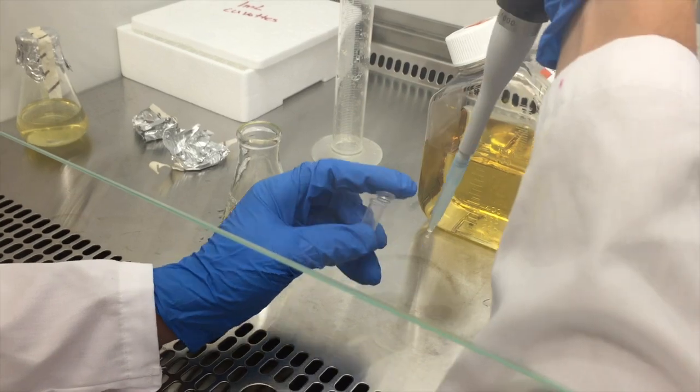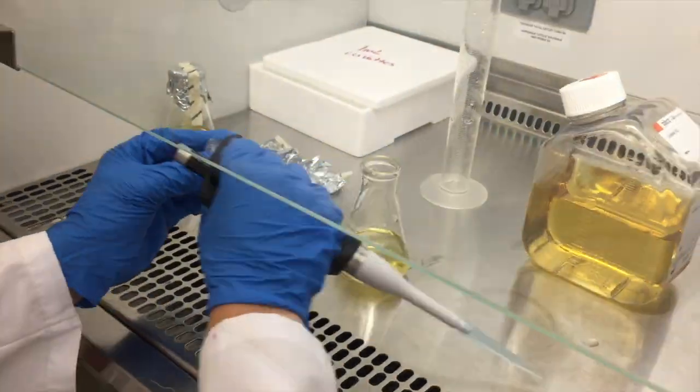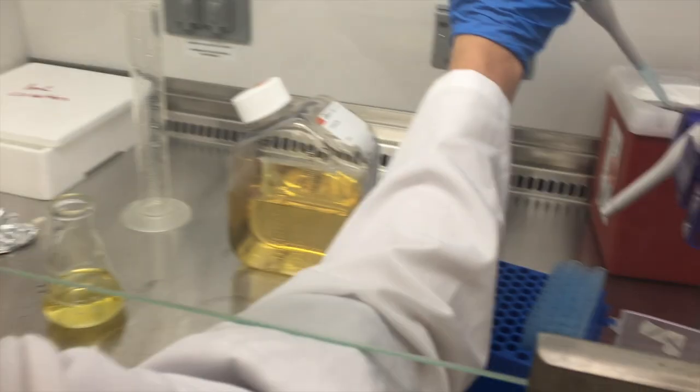Dispose of bacteria containers and pipette tips in the sharps container. Cover the flask and let stand overnight.